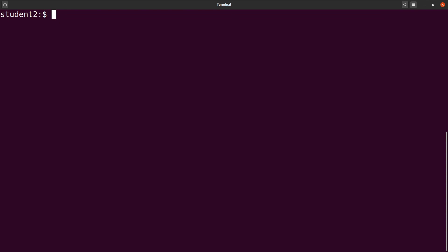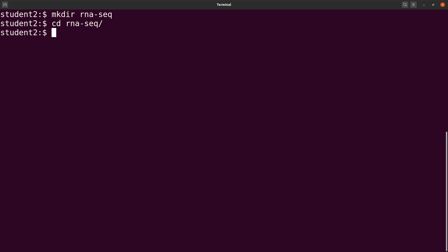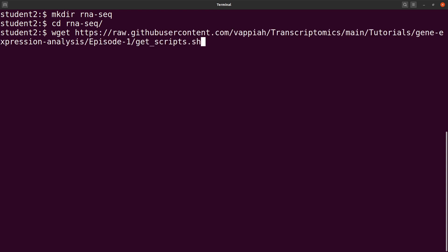On the terminal, let's first create a directory where we're working. So we say mkdir rnaseq, and then let's cd into it. So now we are ready to download the master scripts. To download, I'll use wget — so I'll say wget and then supply it with the link to the file. You can also use curl to download; the choice depends on you.